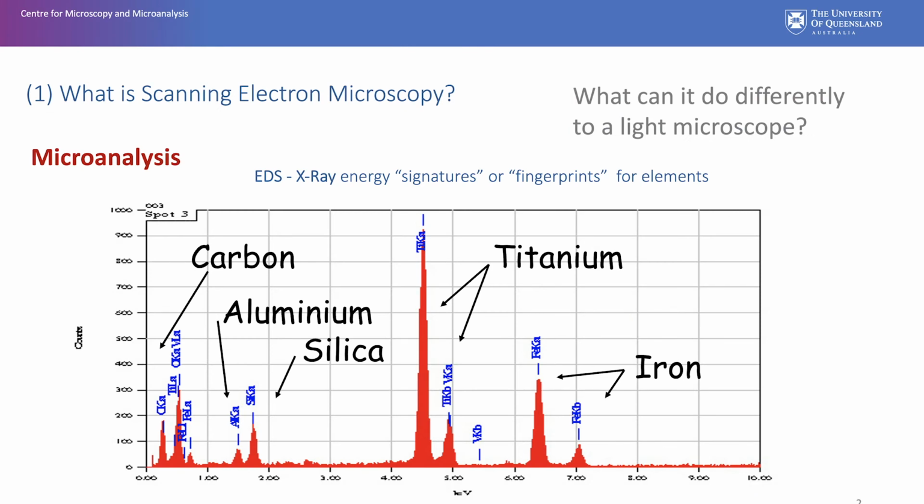So if we just have a look at that spectra a little bit more enlarged there, that EDS spectra, you can see here we have counts per second, up to about 1,000 here. Looking at that point, spot 3, you can see on the previous slide, and we've got some really nice identification for particular elements that are in this compound that we're analysing.